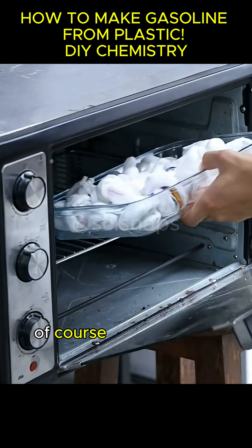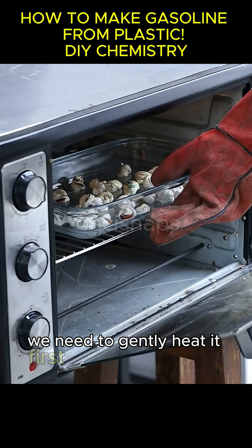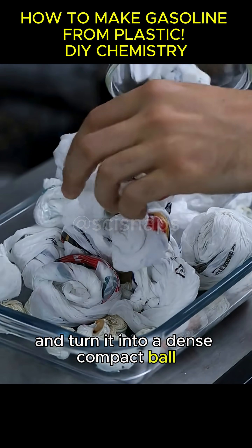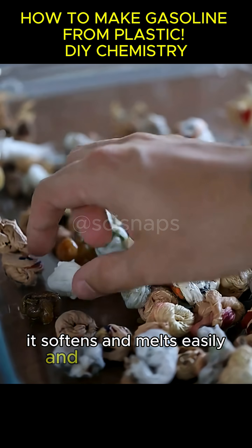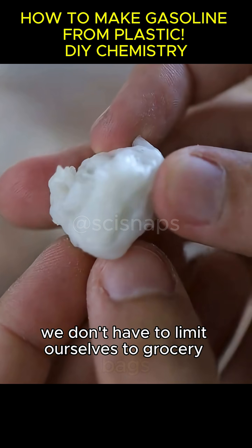Of course, you can't just toss a plastic bag straight into the pot. We need to gently heat it first to remove all the air and turn it into a dense, compact ball. This works because polyethylene is a thermoplastic. That means when you heat it, it softens and melts easily and can be reshaped.